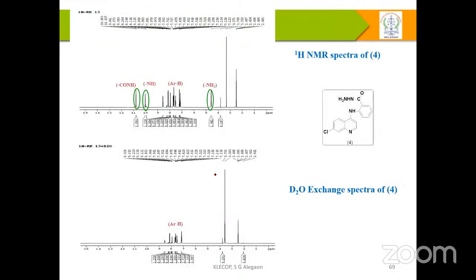And when you see this in the hydrazide, we have just compared with this one. So these are the NH2 group and NH, and when you take the D2O exchange, they are missing. This is the best way, that is the take-home message in the last IR tool comparison. And comparison always makes you more perfect. Whenever you are doing any IR and NMR structural elucidation, always take the previous step's NMR and IR. That can help you. That is the best way to understand retrosynthesis also.